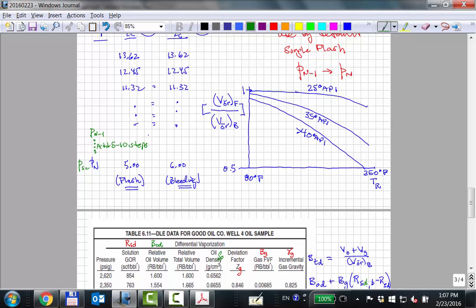Just artificially. Go from, what was it, 15 bar, the first step might be 10 bar. Then you go 10, 9, 8, 7, 6, 5, down to 1. That's simulating something similar to a bleeding process. So you basically try to simulate bleeding.